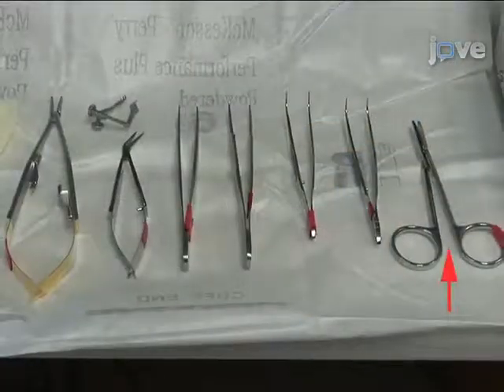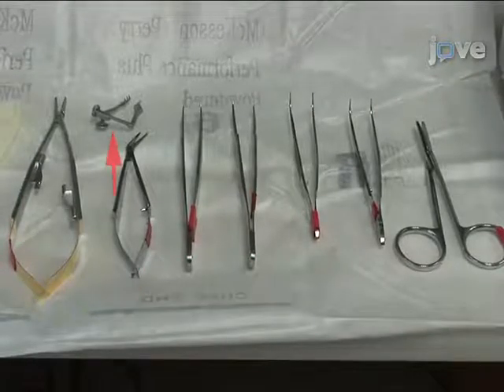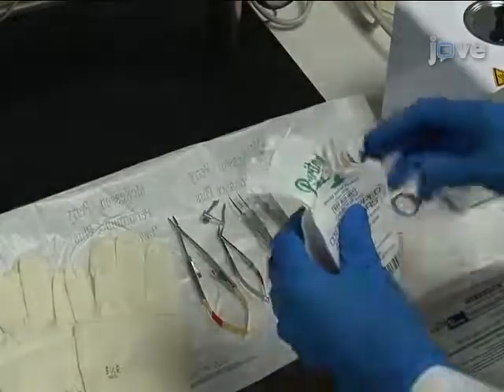A pair of blunt scissors, two coarse curved forceps, two fine 45-degree angled forceps, a pair of angled spring scissors, a chest retractor, and a needle holder. Cotton applicators should also be on hand in case of bleeding. With the operating field prepared, we can proceed to intubation of the mouse.